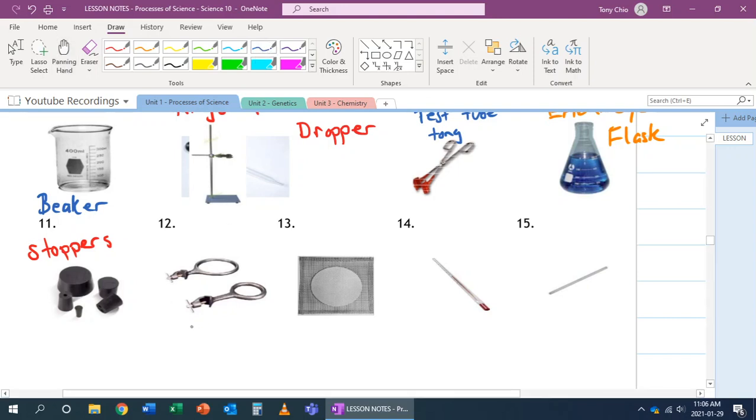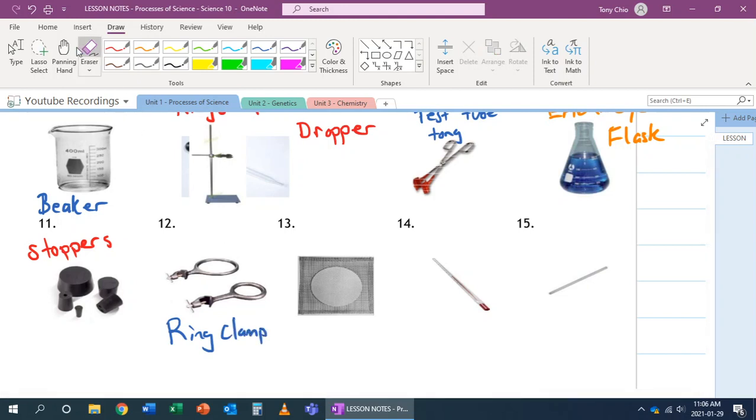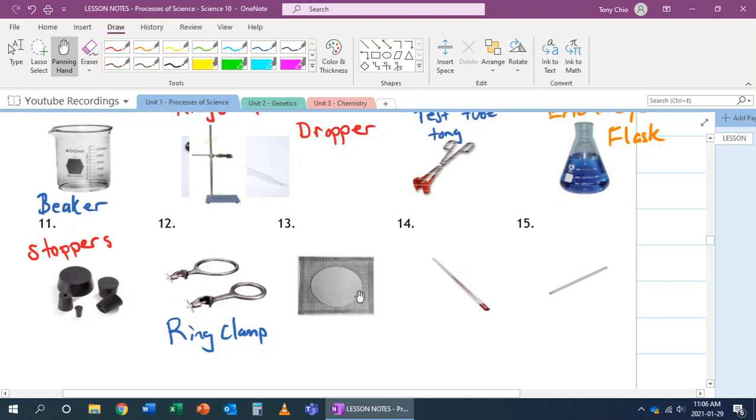Number 12 is called a ring clamp. Ring clamp is used to, for example, balance a beaker on it. You can use it for holding a wire gauze, for example, on it, so that you can conduct experiments without using your hands.